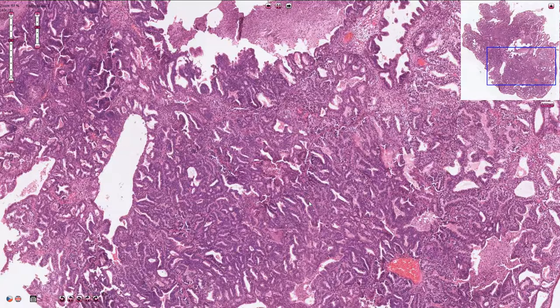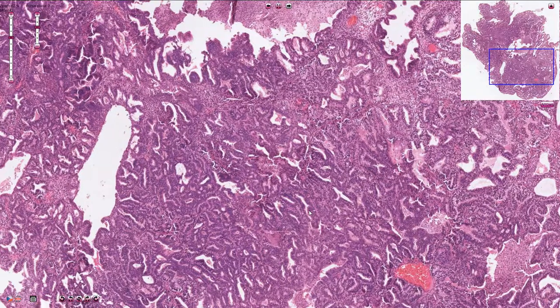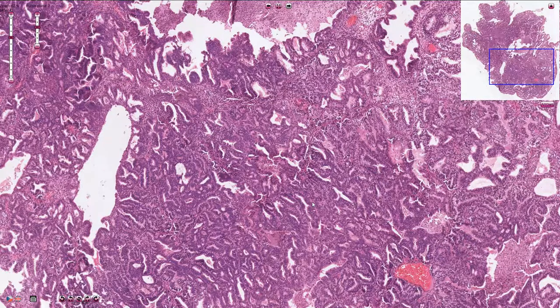Endometrial adenocarcinoma is often associated with adjacent endometrial intraepithelial neoplasia or atypical hyperplasia, which is a precancerous lesion that can progress to endometrial adenocarcinoma.